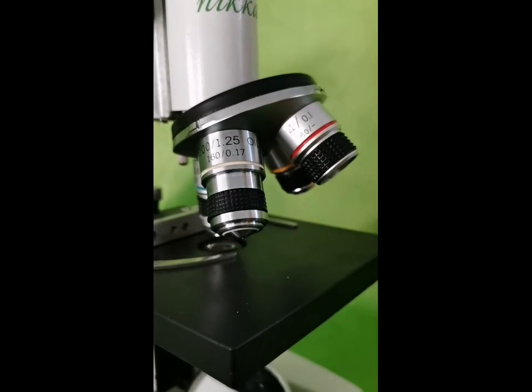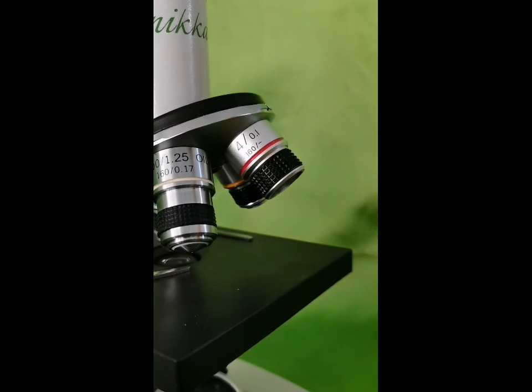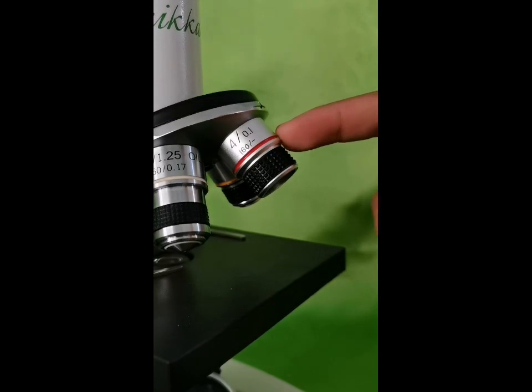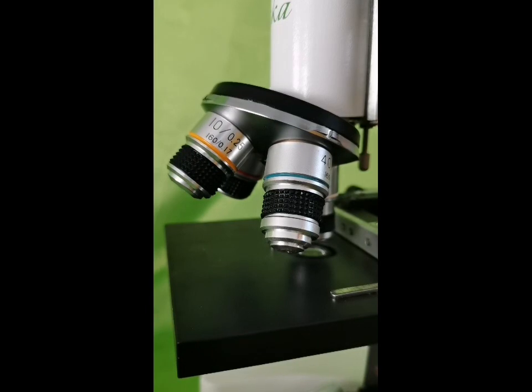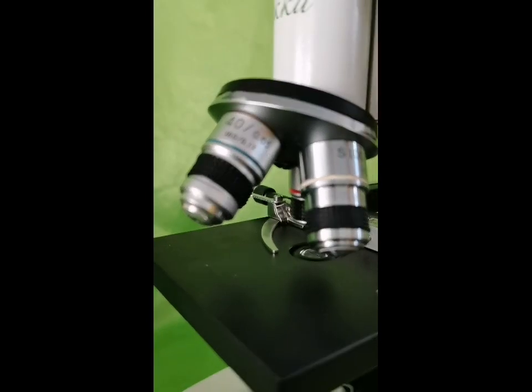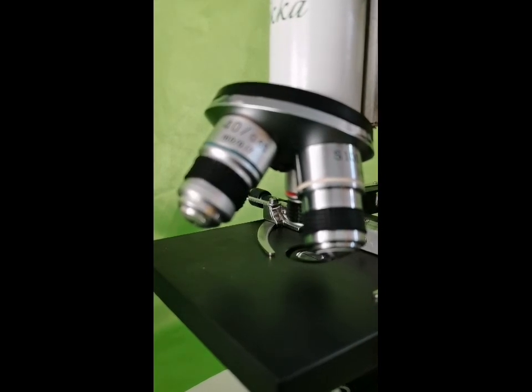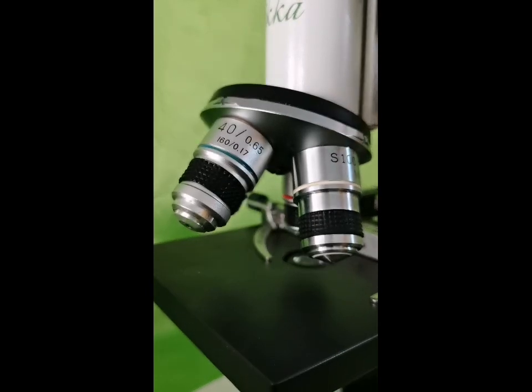First is the scanner. The scanner is the shortest one and can be marked 3 times, 4 times, or 5 times magnification. Second is the low power objective, or what we call the LPO, which is marked 10 times or 12 times magnification. And the next one is the high power objective, or the HPO, and it is the longest one, and it is marked 40 times, 43 times, or it can be 60 times magnification.